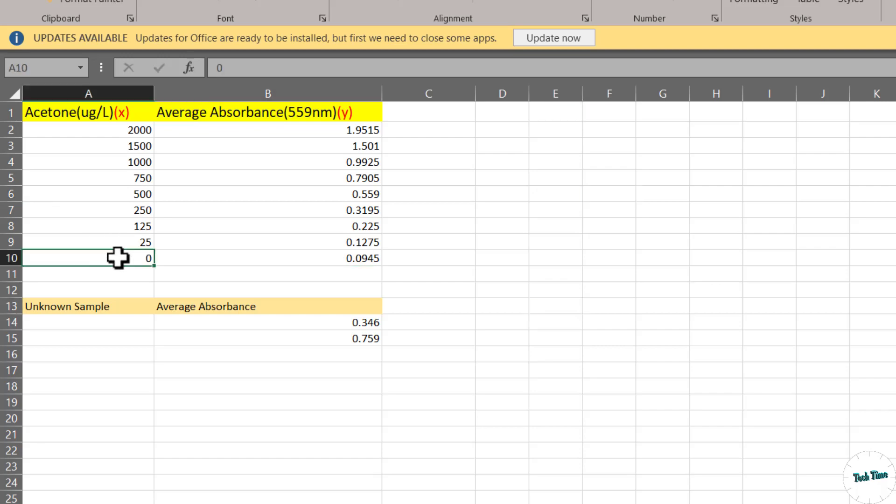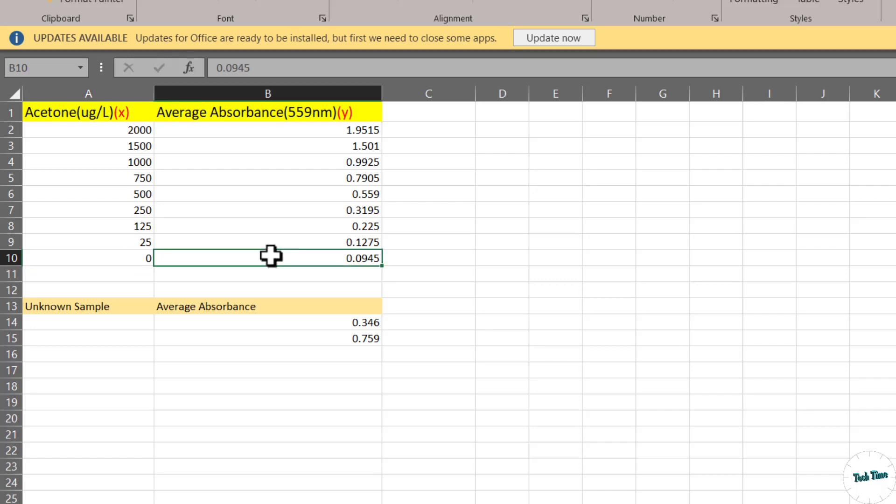Right at the bottom you can see we have a water sample without any acetone concentration but it does have some absorbance as well. This particular absorbance is called background absorbance.